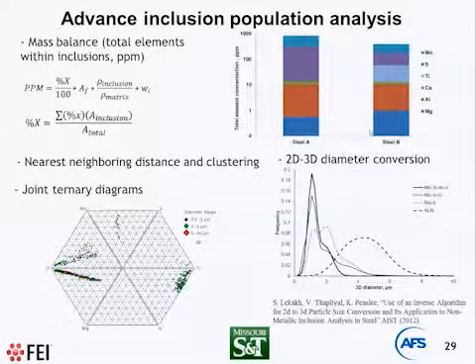Okay, and this is an example of steel mill, this log scale. And you can see that total inclusion concentration significantly would be changed from one steel to another steel. Another important tool: all our inclusions which we observe are in 2D sections. When we cut, sample, polish, we see something in 2D sections. Of course, what we see in 2D is significantly different than we have in 3-dimensional.